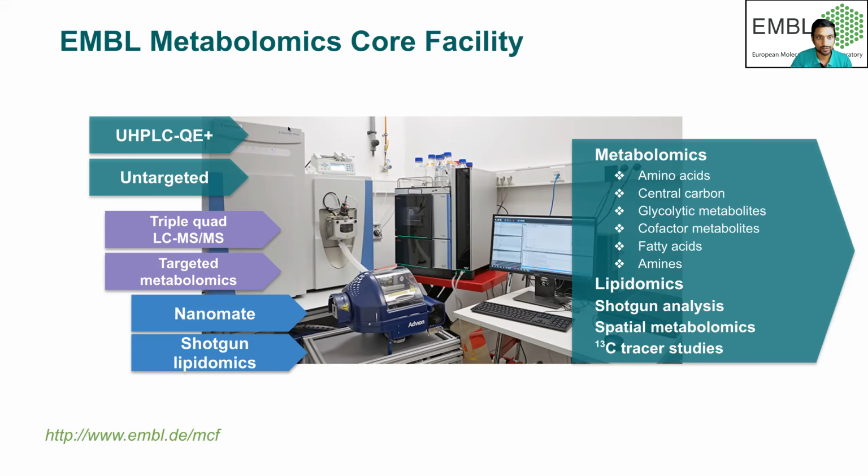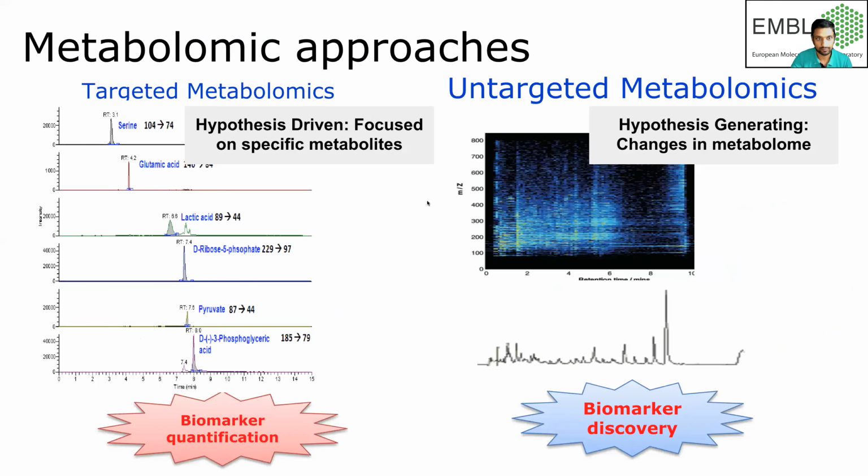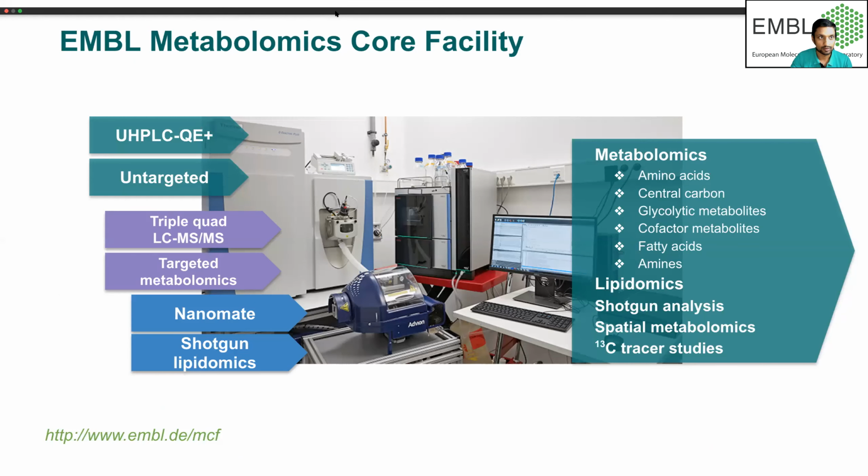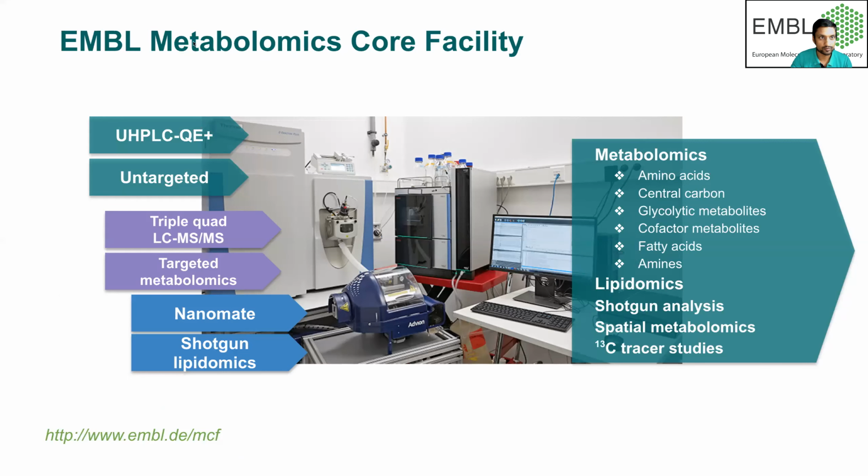So if I can just show you what they mean: this part of the instrument is the LC part and this is the mass spec part. I hope I'm able to show you guys.